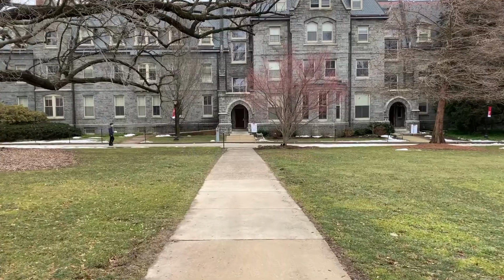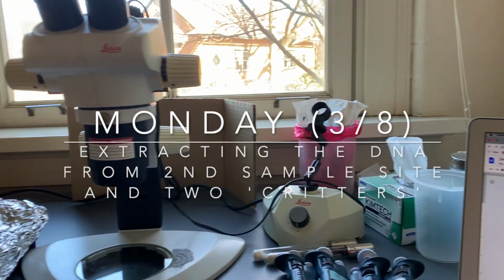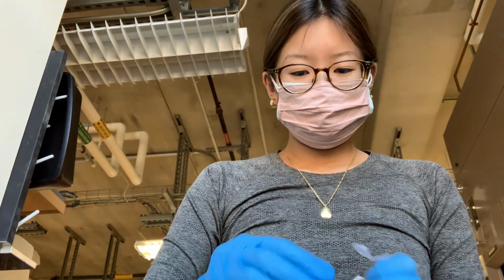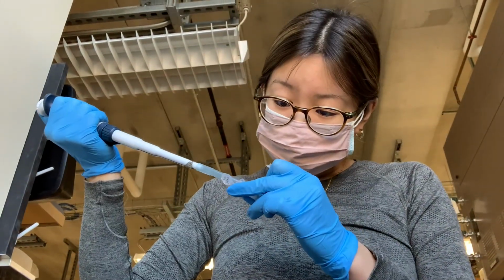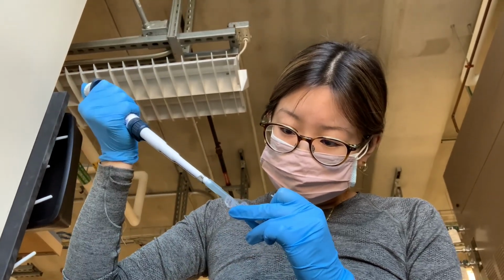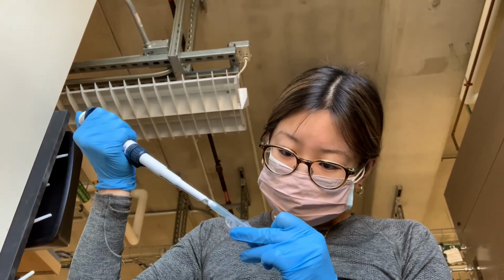Today we'll be extracting the DNA from both the second site sample, Bryn Mawr pond, for metabarcoding, and 2 critters from either site for target barcoding. Like in week 3, we'll be following the QIAGEN DNeasy blood and tissue protocol, which requires me to first remove the solution from the second site 1.5 ml tube and avoid touching the filter.